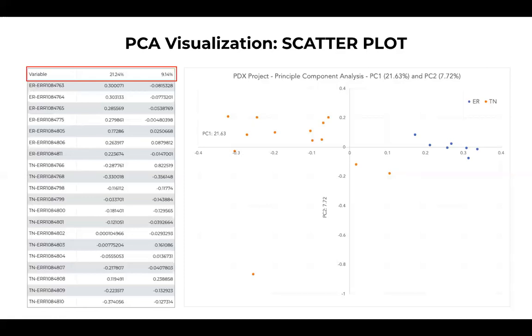We can plot both and understand the variation which it extracts out of this big data. So talking about the nature of these components, these components PC1 and PC2 which you see here are principal components. These are the components that are derived out of that big data. The components are characterized on the basis of variation that exists in the expression levels.